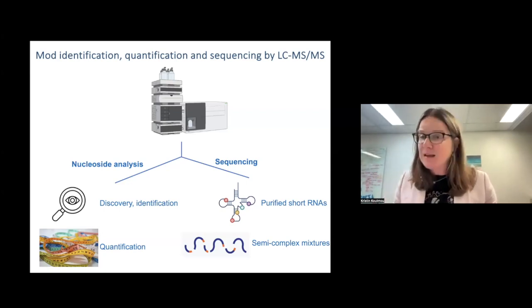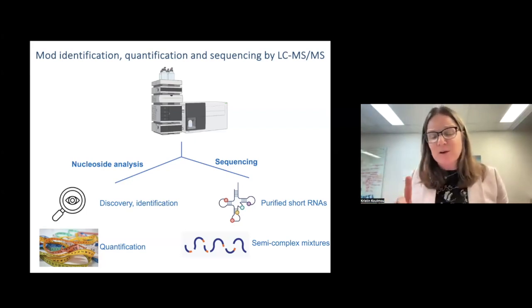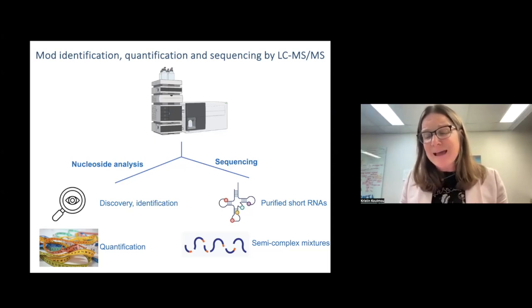which would be like one, for example, Moderna did this with one mRNA, where it took a single mRNA, it knew what the sequence was, and it was able to digest it down and look at it on the mass spectrometer. However, looking at more complex sequences, the kinds that a biologist like me might be interested in, has been really much more difficult.